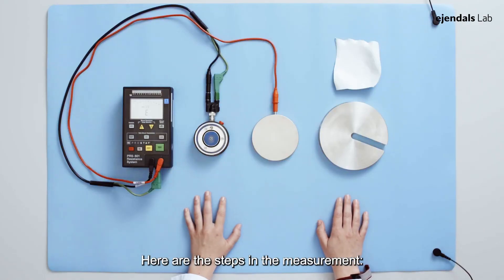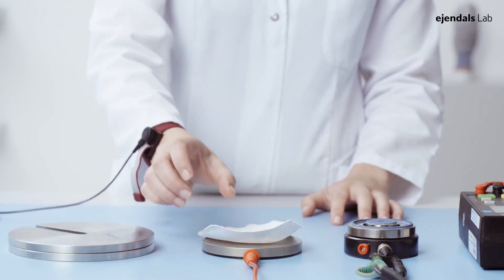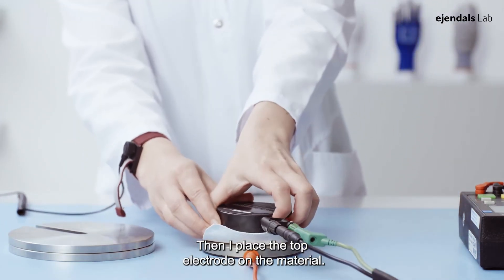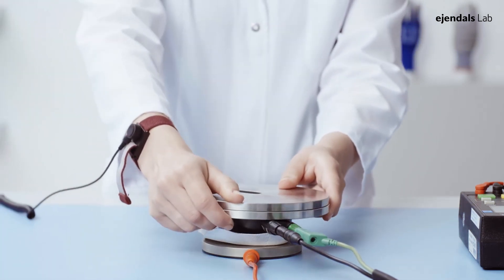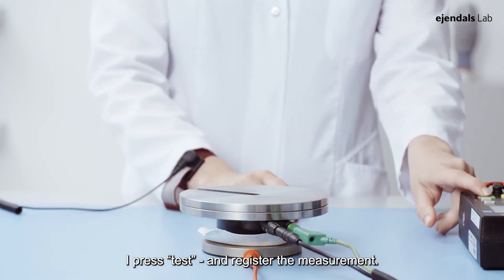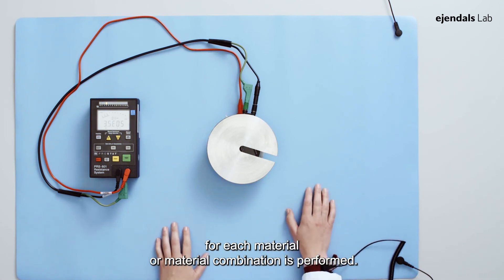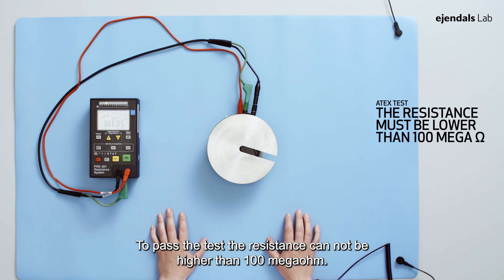Here are the steps in the measurement. First I place the material on the bottom electrode. Then I place the top electrode on the material. Now I place the weight on the top electrode, press test and register the measurement. Five measurements for each material or material combination is performed. To pass the test, the resistance cannot be higher than 100 Mega Ohm.